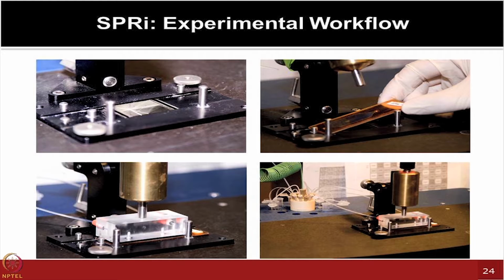And it probably reminds Josh of one of the old setups we have, the prototypes, where you can test 8 antibodies, for example, or 8 different proteins in a very new format, like you are developing a new instrument setup, and these kind of solutions are coming in. You have the gold chip, everything is passing through it, and then going back into the washing containers.